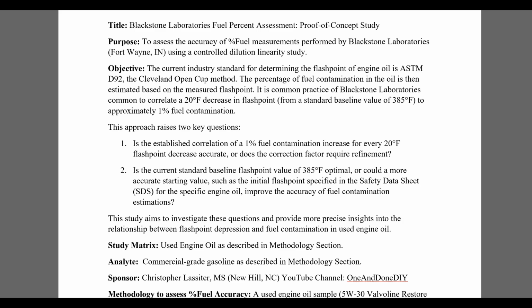Now, one quick thing I'll say about FTIR before I move on is that FTIR is not really comparable to the Cleveland Open Cup method, which is typical flashpoint testing. And why am I talking about FTIR versus flashpoint testing? Because after all, we're talking about percentage of fuel, right?